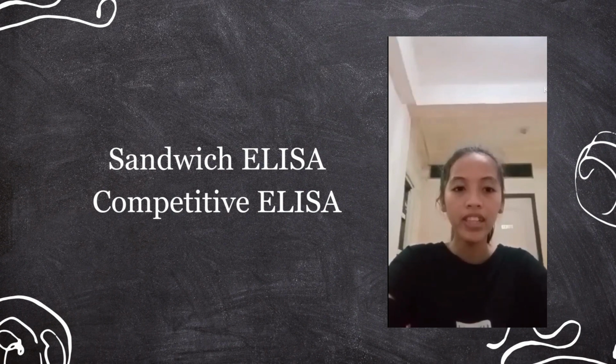Competitive ELISA. Competitive enzyme-linked immunosorbent assay is another type of immunoassay used to detect and quantify the presence of specific proteins or antigens in a sample. It is based on the principle of competition between a labeled antigen and an unlabeled antigen for a limited number of antibody binding sites. So, in a competitive ELISA, the target protein or antigen in a sample competes with the labeled antigen or a labeled antigen analog for binding to a limited amount of specific antibodies that are immobilized on the surface of a microplate. So, the process involves several steps.